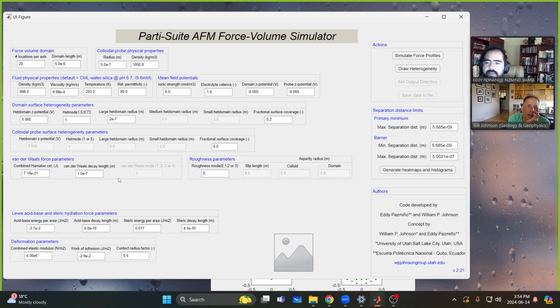I'm just kidding. So the heterodomain radius that's chosen by default is 200 nanometers. There's no specific reason. But if you look at papers, Eddie started this work back in 2000, his first publications were in 2014. And then Cesar Ron, coming from the same institution as Eddie, continued this work, and he's got publications in 2020 that show that these heterodomains should be sitting in the sub 100 nanometer size range, okay? And so 200 and lower are reasonable numbers to play with.